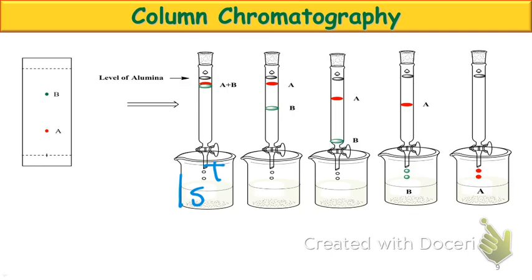So we'll then put our solvent, or our small amount of solution that has our compound in it, onto the top of the column. What's going to happen to our compound now? Any ideas? It's going to progress downward to the solution. Okay, should it move? You're probably not going to move a whole lot. You do have gravity pushing down, okay? But gravity is not going to be strong enough to break the intermolecular attraction between the silica and your compound, regardless of how polar or nonpolar your solvent or your compound is. How do we get our compounds to actually move?